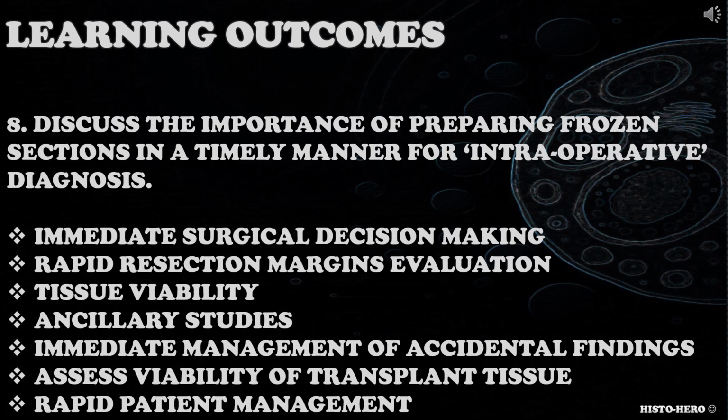The eighth learning outcome is for the candidate to discuss the importance of preparing frozen sections in a timely manner for intraoperative diagnosis. Why is it important to prepare frozen section rapidly? Consider immediate surgical decision, optimal and rapid patient management, minimizing anesthesia time, maintaining tissue quality and viability, to enable ancillary studies, to rapidly assess viability of transplant tissues or organs, to rapidly manage accidental findings.